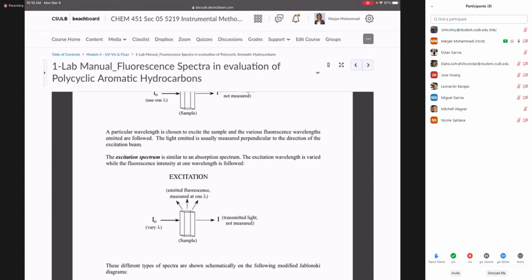Right now you are lucky. So you are going to repeat all those for anthracene, collecting data from the UV and making a calibration curve. So far, 4 UV graphs, 4 calibration curves. Agree?